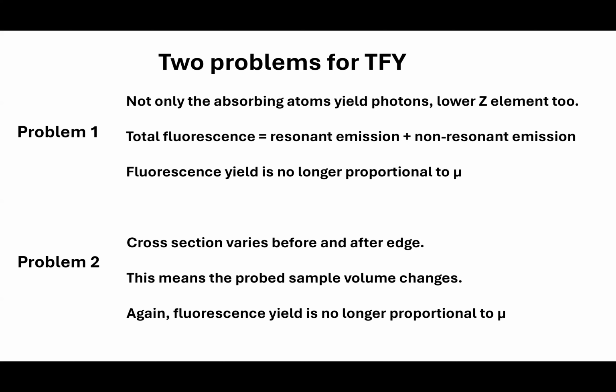Right? So you have access to a lot of elements, even though they're doing the experiments probably at 6 or 7 kV. But you have fluorescence access to a lot of elements, including sulfur. So you do get fluorescence from those elements, even though you are exciting at a very different energy, because those are coming from the non-resonant emissions.